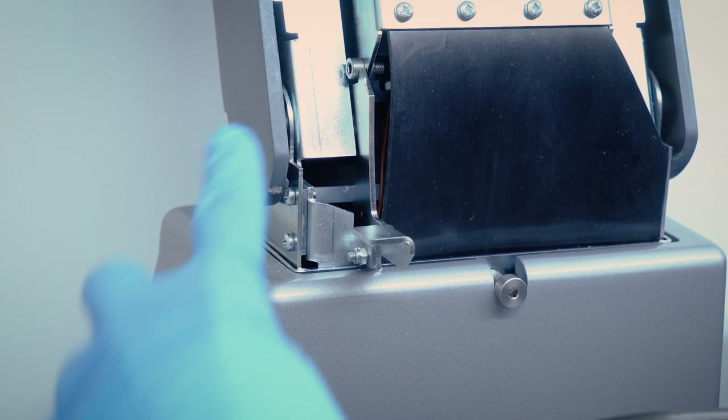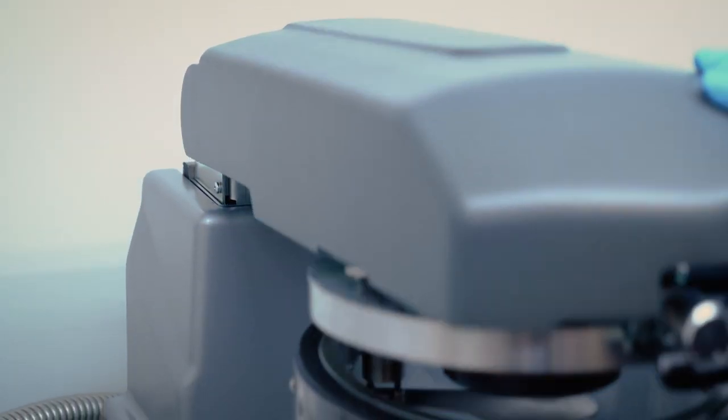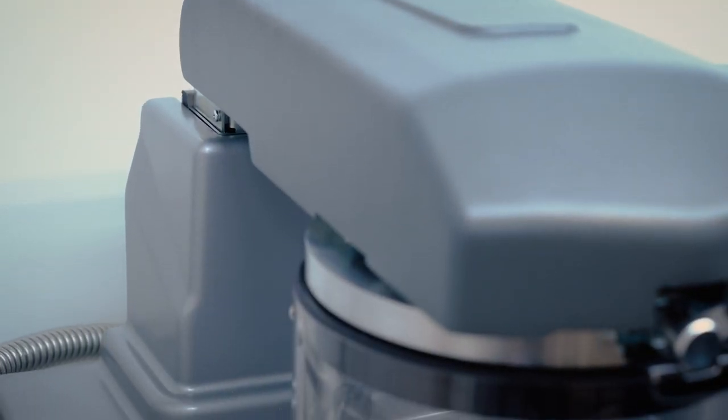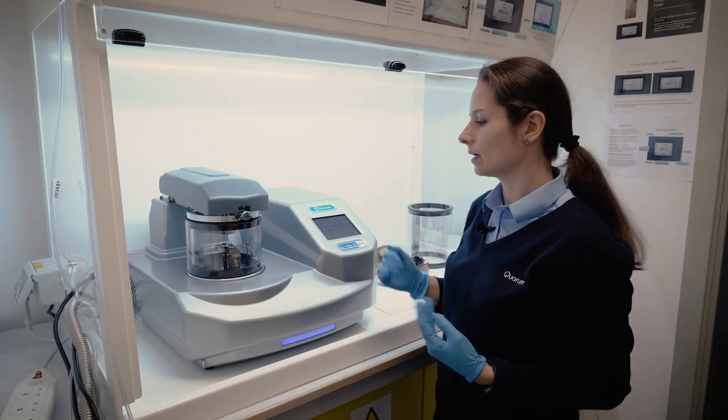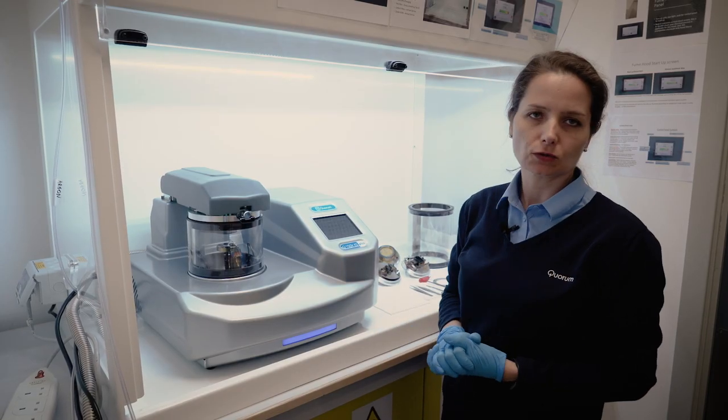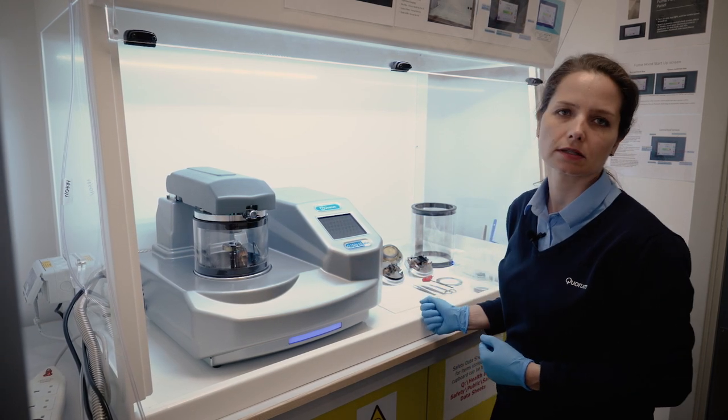There is the safety latch on the lid that we need to disengage to close the lid. The latch prevents the lid to fall and break the cylinder. Now everything is ready to choose the correct recipe parameters and run the process.